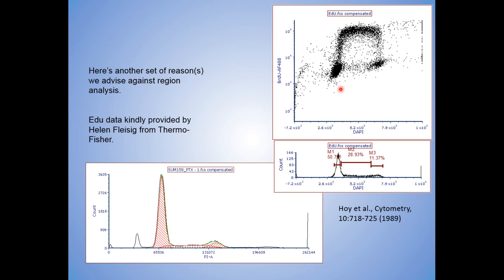This is taking the entire swath of events from here all the way up here and assigning them statistically to this M1 or G1, G0 in region analysis. That's the error. It's including cells that should not be included.